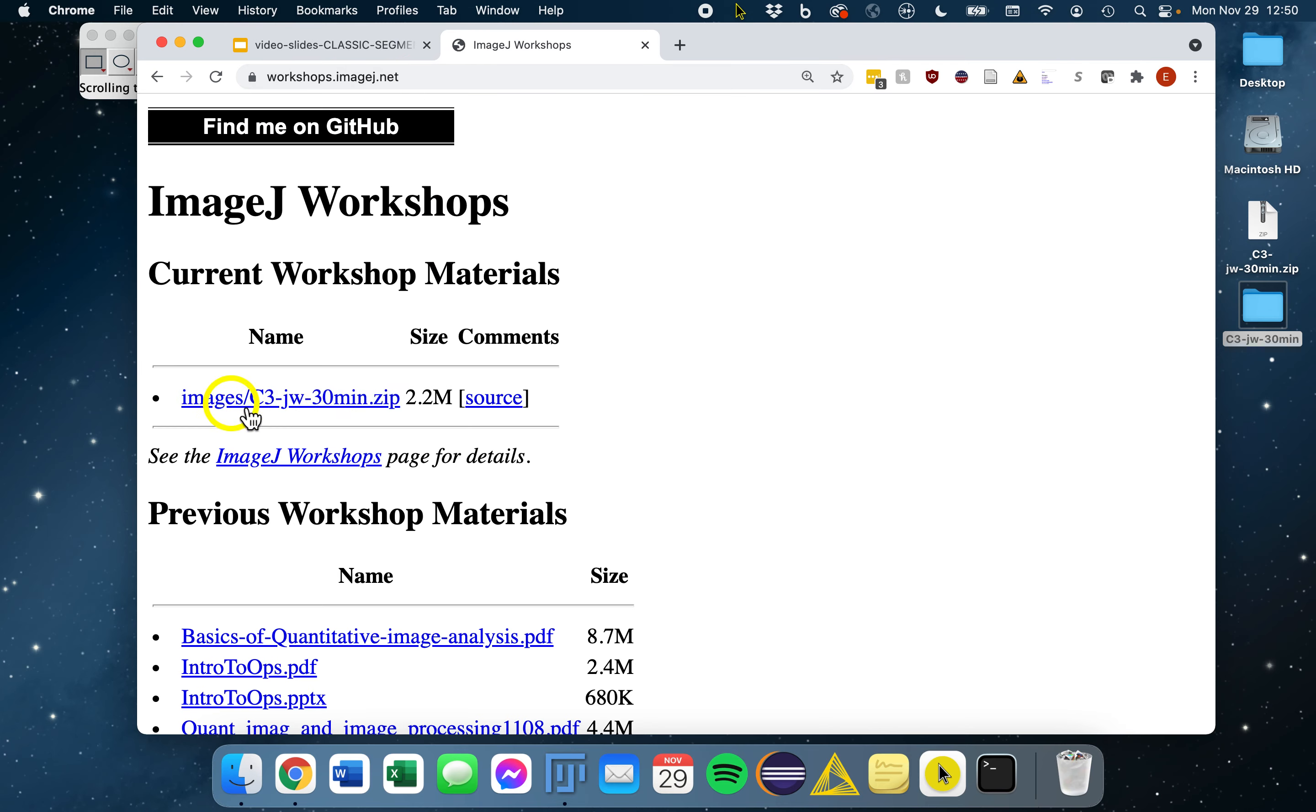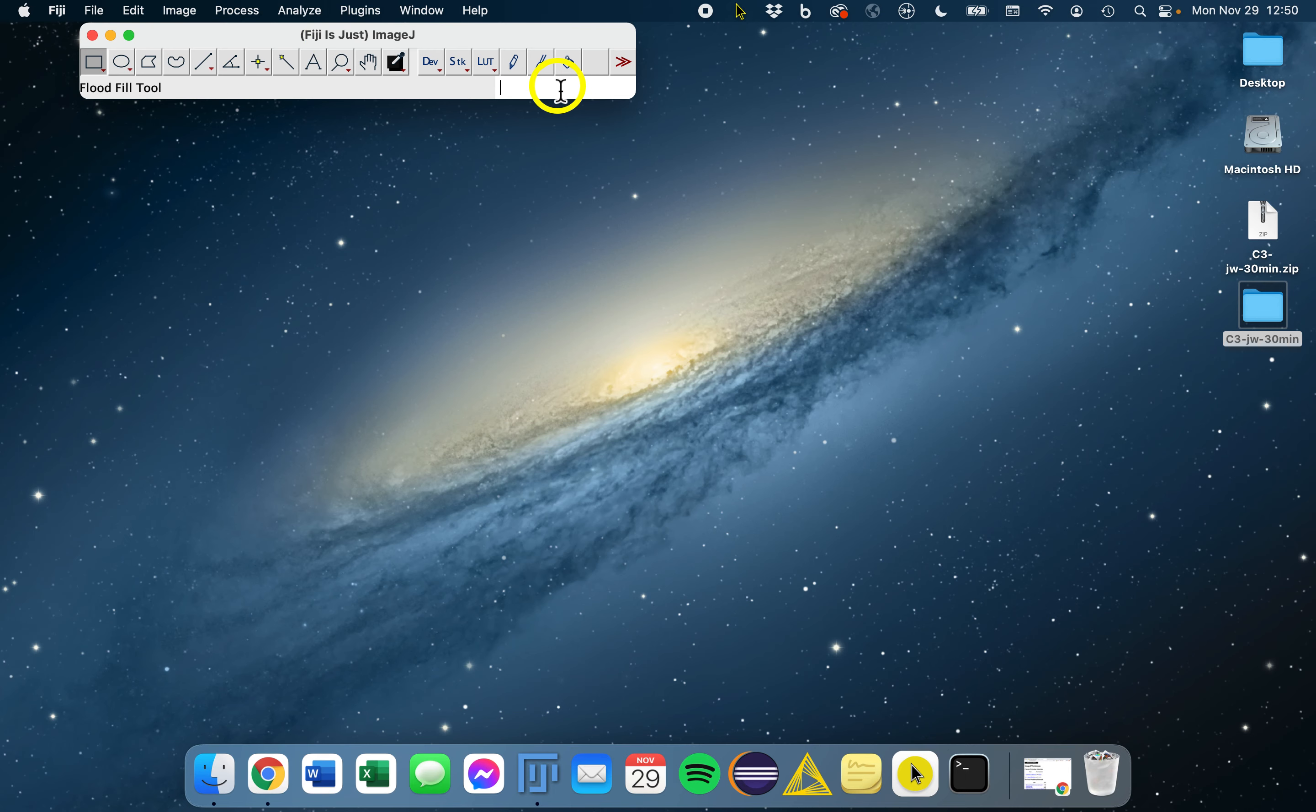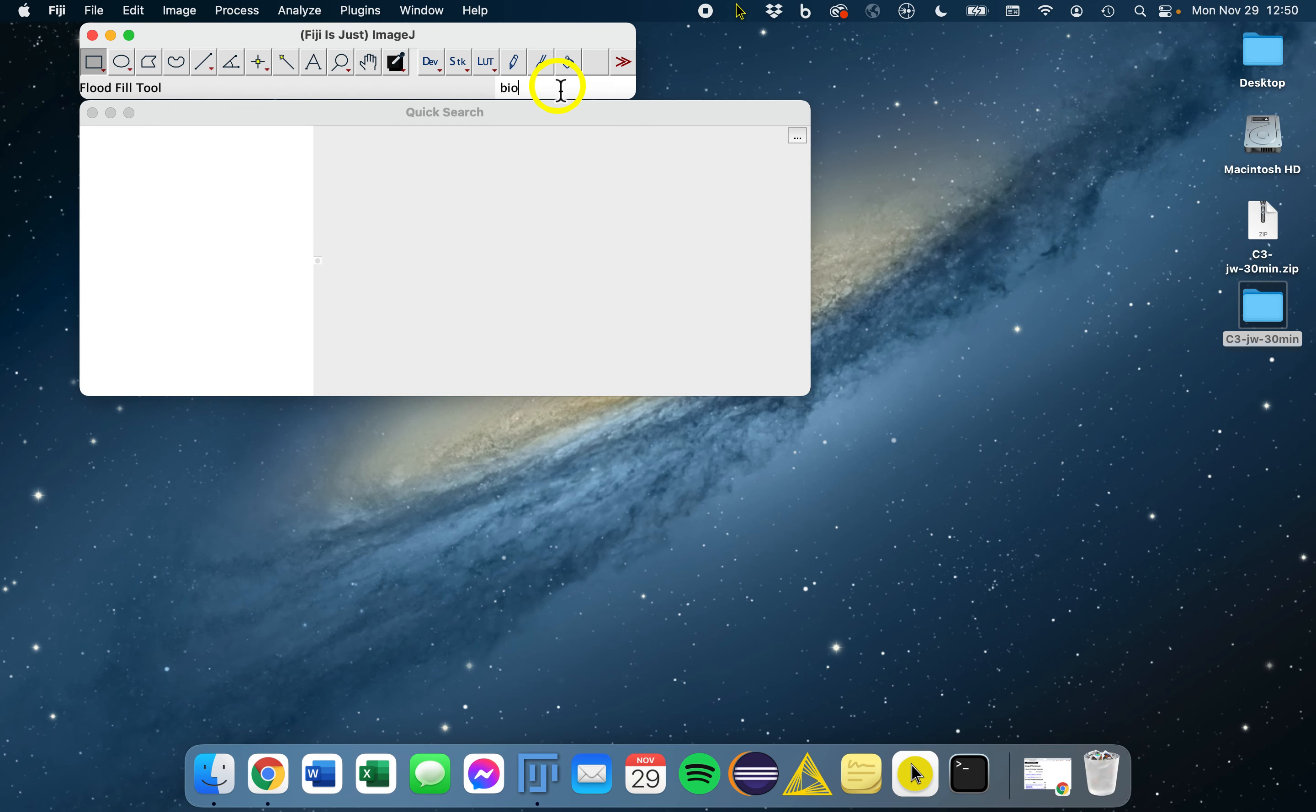Download the top zip folder that's found here, the C3JW 30-minute zip file, and unpack it. Then we will open our example image using bioformats.